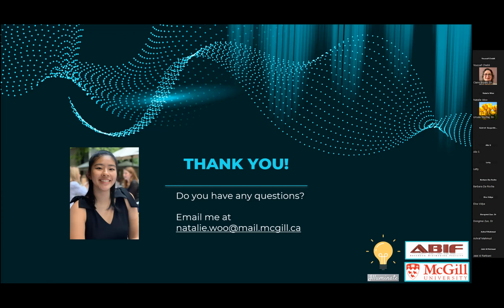Personally, or is that something that people do? I know some people, so I was actually just reading up before, some people actually take it out of the water. If you're immersing it in water, it could remove the fluorophores and that stuff. And so some people actually end up drying their samples after expansion for storage.